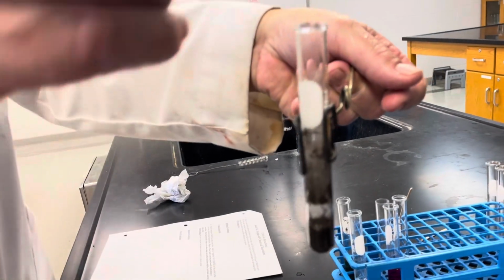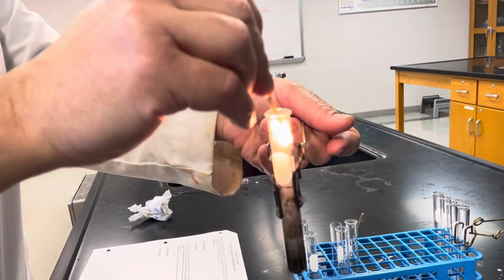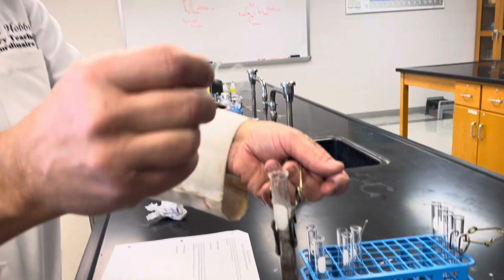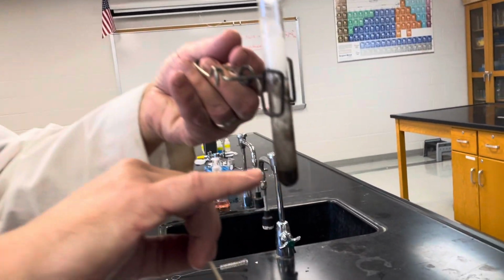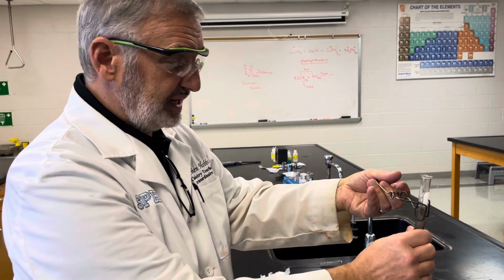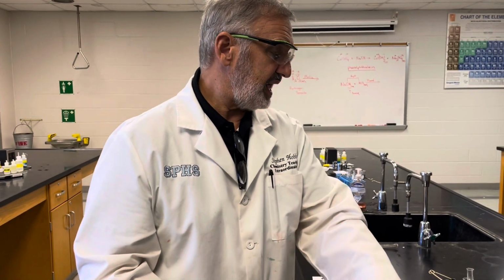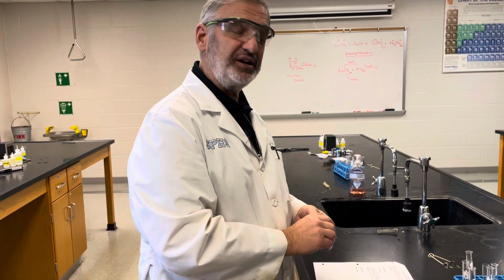So I'm going to tap this out, and I'm going to put this down in here, and it's magic. It's kind of like those magic birthday candles that just won't go out. You just keep putting it back in there, and it catches back on fire, okay? So we have to figure out, what is being given off in here that causes this to catch on fire? It's still bubbling down here, and it's getting very warm again at the bottom. So that is our fifth reaction. That's the hydrogen peroxide being added to the MnO2. But the MnO2 is actually going to be a catalyst, not a reactant.